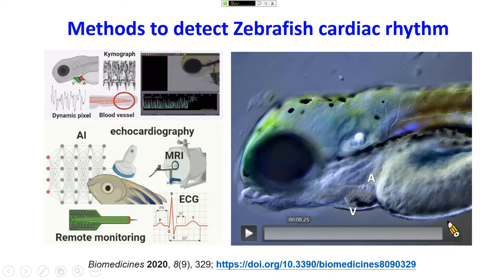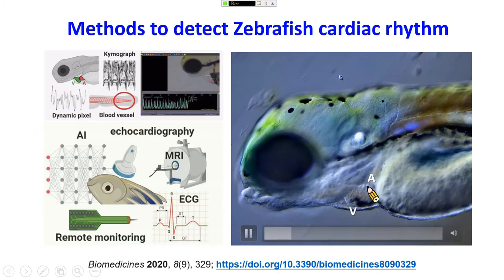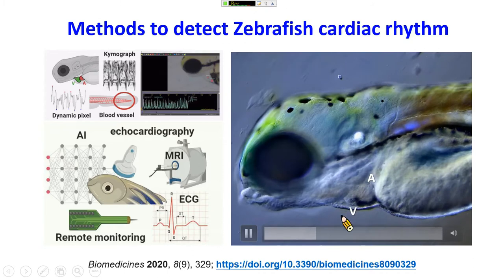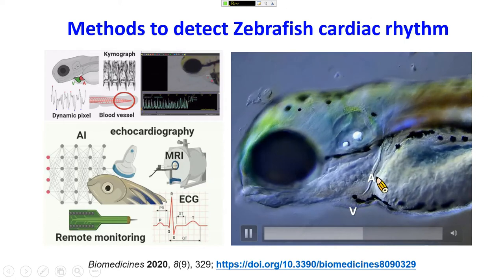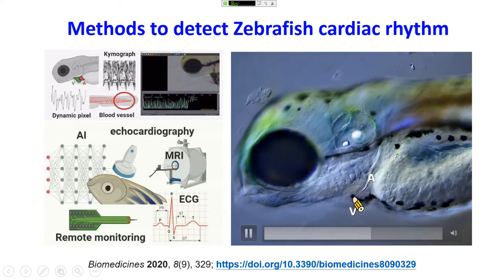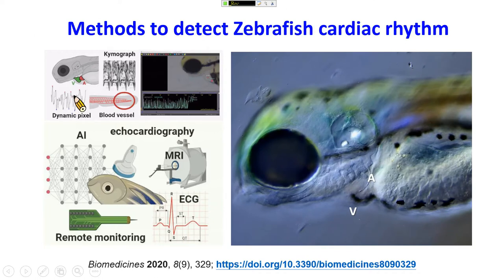This video shows the zebrafish heartbeat. On day 3 to day 5, you can see the atrium pumping and the ventricle pumping. Because the zebrafish embryo during early development is transparent, it is very easy to see the coordination of atrium-ventricle beating. In zebrafish embryo, we can detect cardiac rhythm based on the image.